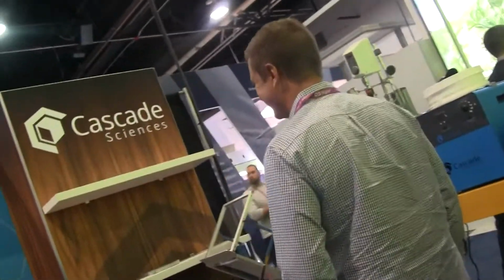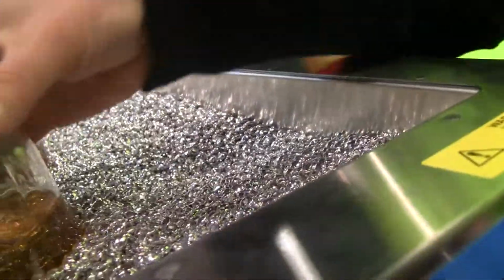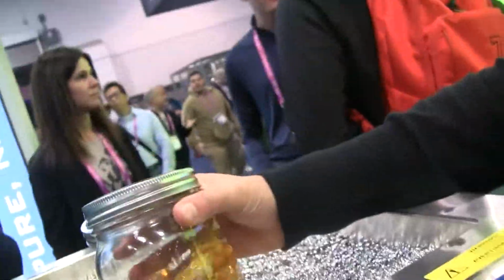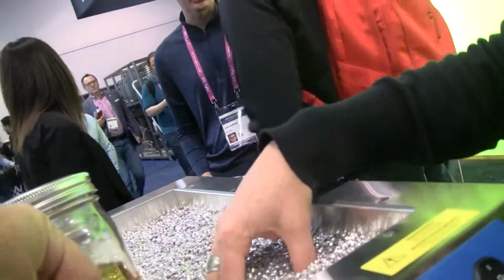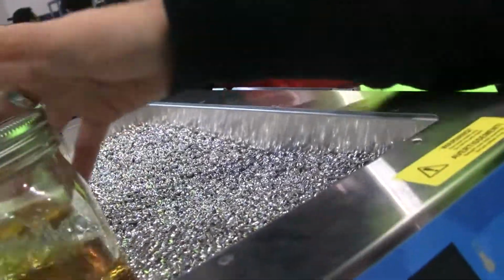This is just a fun little lab toy. It's not really a toy, but it's a piece of lab gear that will make a big difference in the cleanliness of a lab. So this is a bead bath, and these are thermal beads. They're a patented aluminum coated bead that you heat up, and it will keep your oil in the proper temperature-controlled viscous state.